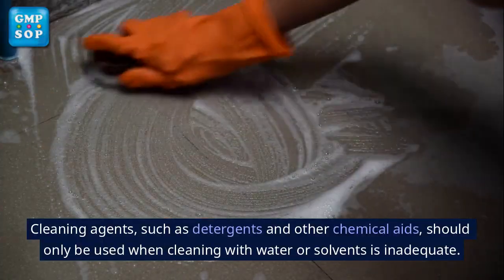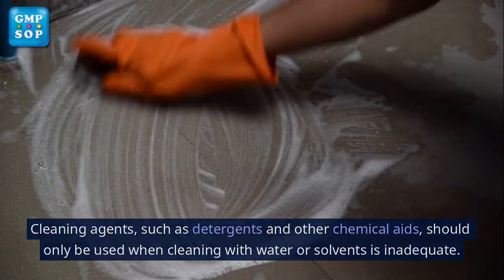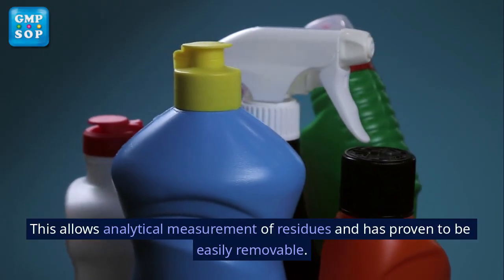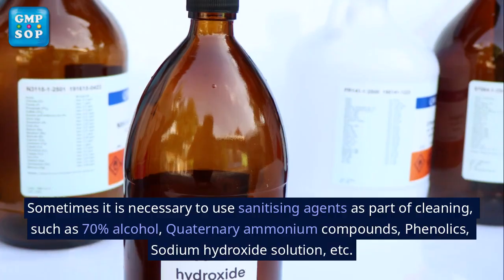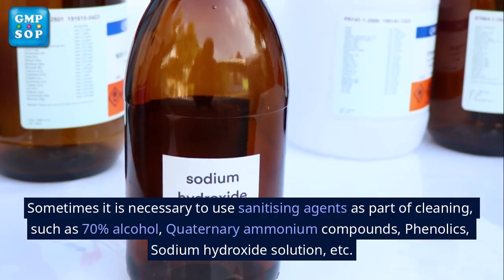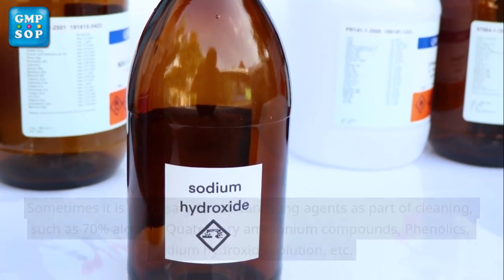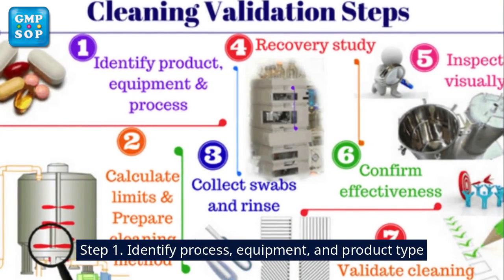Types of cleaning agents in cleaning validation. Cleaning agents, such as detergents and other chemical aids, should only be used when cleaning with water or solvents is inadequate. Only approved cleaning agents should be used whose compositions are known. This allows analytical measurement of residues and has proven to be easily removable. Sometimes it is necessary to use sanitizing agents as part of cleaning, such as 70% alcohol, quaternary ammonium compounds, phenolics, sodium hydroxide solution, etc.